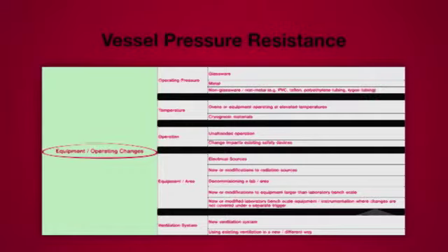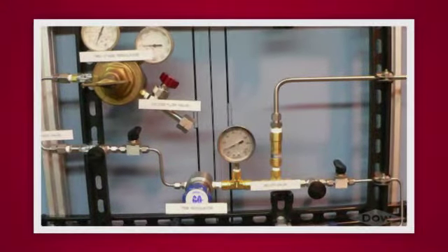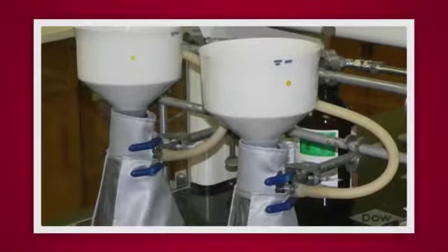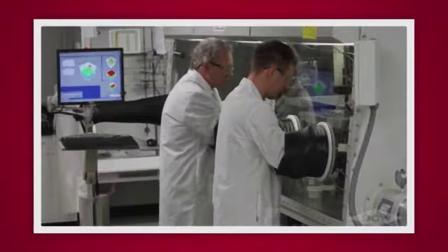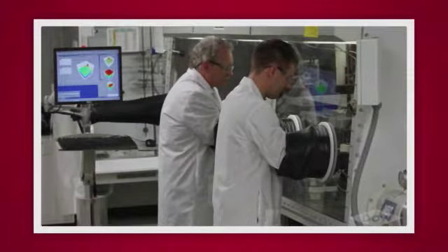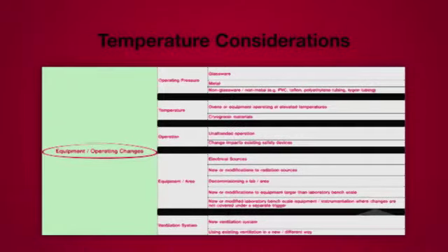Next, consider the impact pressure will have on the vessel. Glass vessels are generally not used under pressure since they can explode, and metal containers, if not properly relieved, can become bombs if overpressurized. Be sure to consider the maximum potential pressures a vessel material can handle. With that information, you can then choose the proper vessel, design pressure reliefs, and install proper protection in the event of overpressurization. Protective shielding could include netting or tape on vacuum flasks, shields in front of glass vessels, or lab fume hood doors. Don't forget to think of heat and the impact of oven temperatures on your procedure.